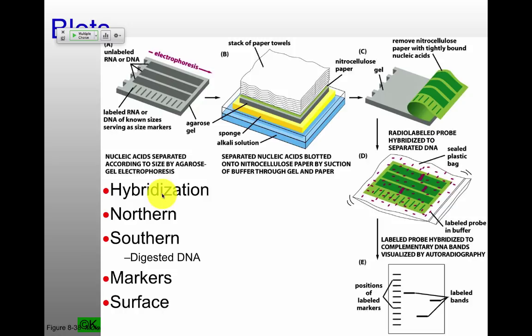We have northern blots. Northern blots are when you're separating RNA. I already mentioned protein gels are called western blots. Why are they called all these strange compass directions? They're actually called these strange compass directions because DNA-DNA hybridization was by a fellow named Southern. And so the original one of these was DNA-DNA hybridization. It was Southern's.